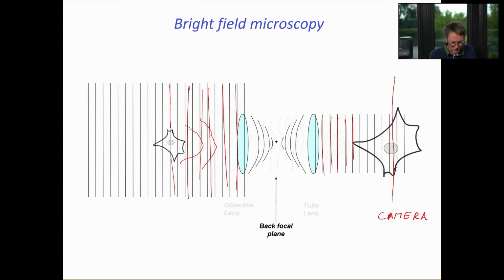You're only interested in the refracted part. And that is the problem of bright field microscopy. So if you take standard cells and you image them in a white light microscope, a bright field microscope like this, then they appear as small shadows on a really bright background, and the contrast is really low because of that background, right? That floods your detector and ultimately your eye, whatever it is.